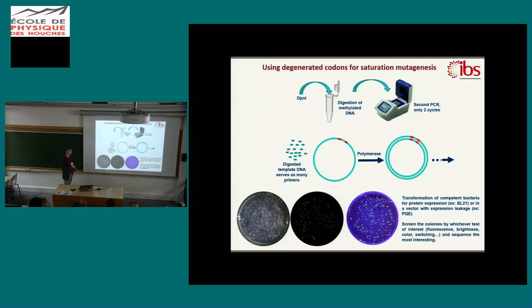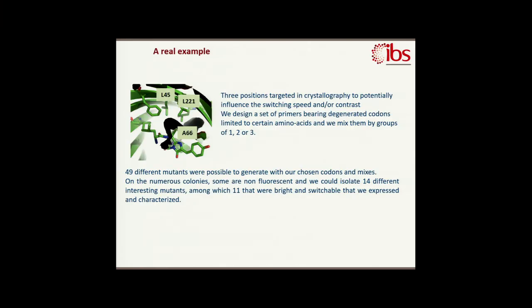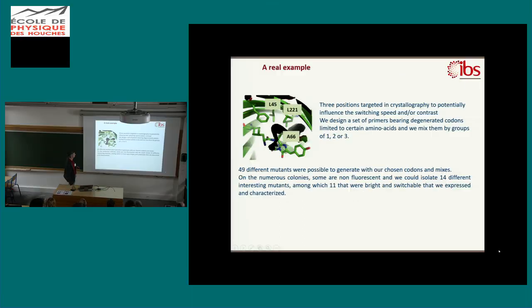Doesn't mean that, of course, you'll generate all of them, because some will not survive, and a lot will not be fluorescent. For example, that's the corresponding number of clones that are fluorescent, and so you can screen the number of clones that are fluorescent, if that's what interests you, or that are switchable, or of a different color, or positive switches. You can color code your different clones, for example with particle recognition tracking software, and see the ones that are interesting to be picked and sequenced, right? So that was an example, but it's not very interesting.